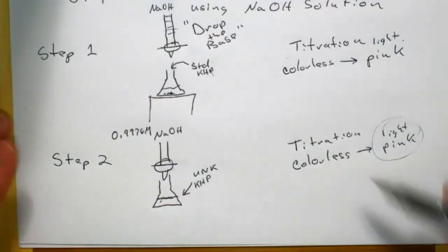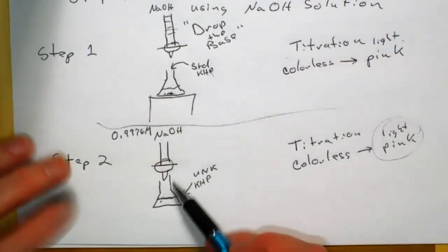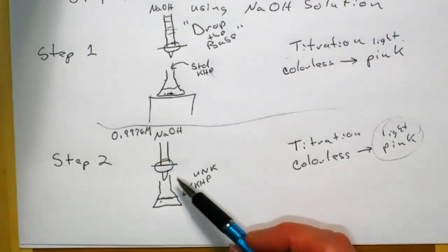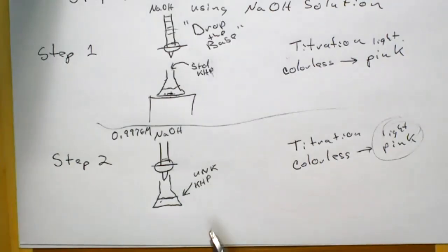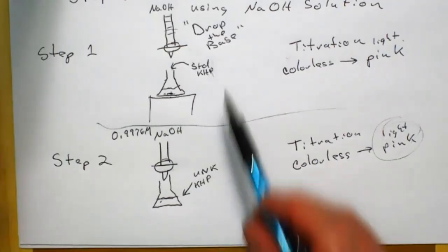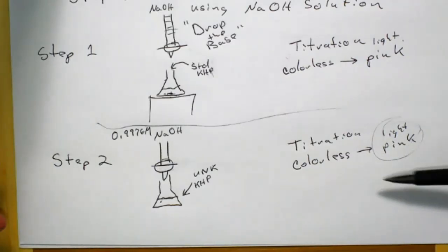You're like, oh, how many people really in lab do titrations? I think I've had 37 master's students, and I bet 27 of them have done titration somewhere in their research, because we don't have an instrument that could do the same steps.